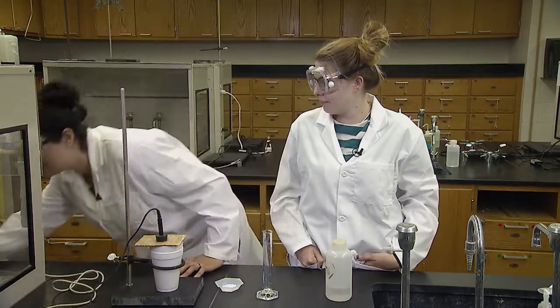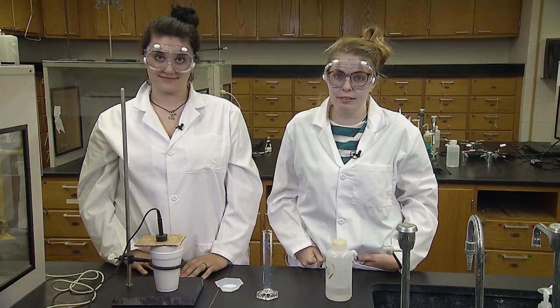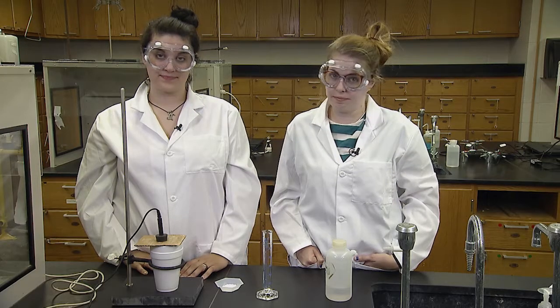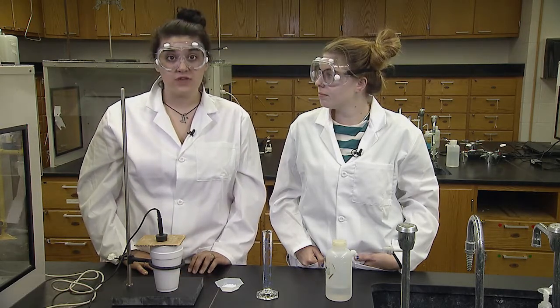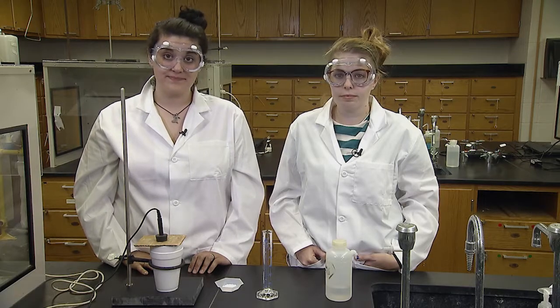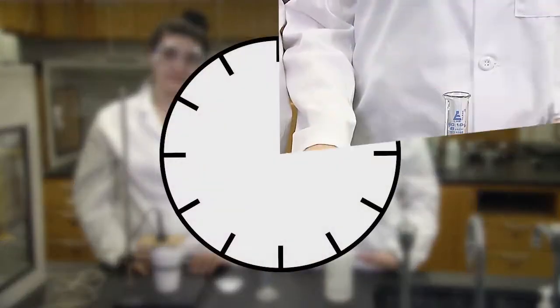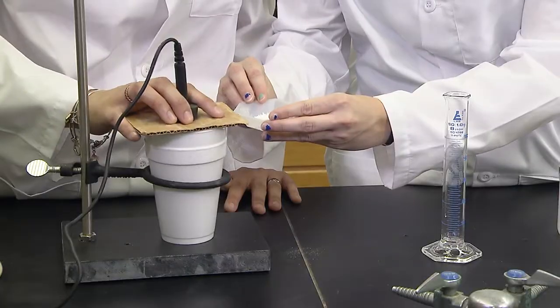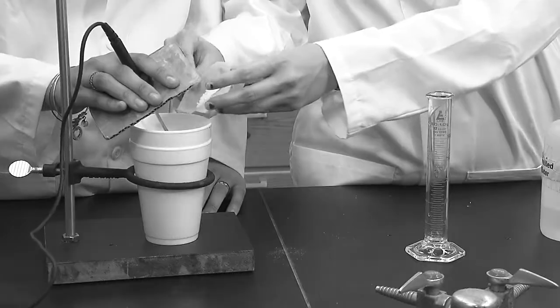Start collecting temperature data with just water in the cup. It should show the experiment will run for 15 minutes; see your lab instructor if it doesn't. The anhydrous magnesium sulfate is added when the collection reaches 4.5 minutes. Don't mix before the computer has started collecting data. While it may seem like a long wait, it is important for the water temperature to stabilize before mixing in the solid. Work together to quickly add the solid — if you take too long, the heat of the reaction can escape.